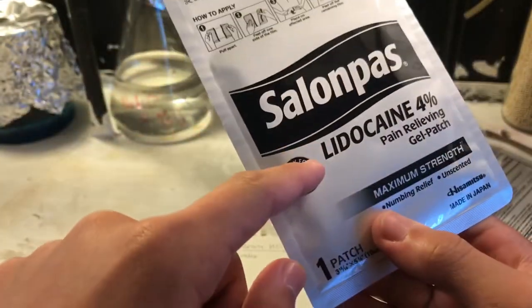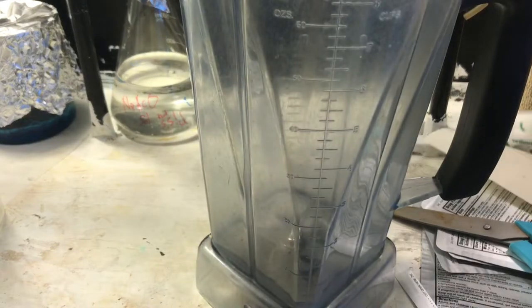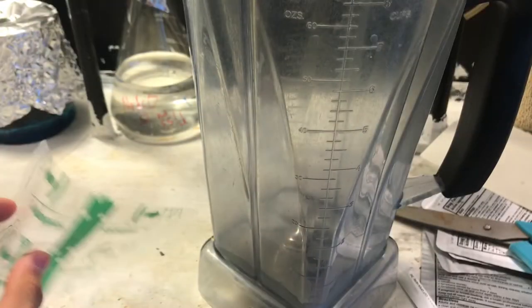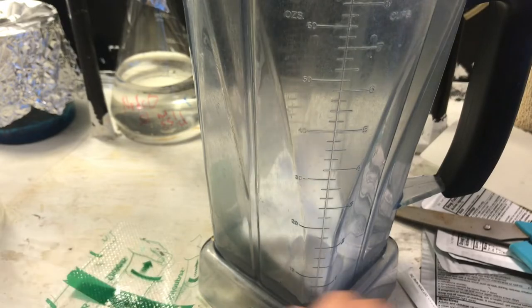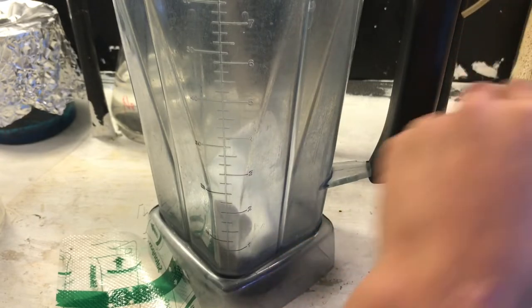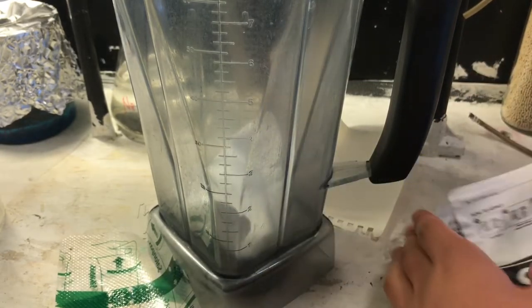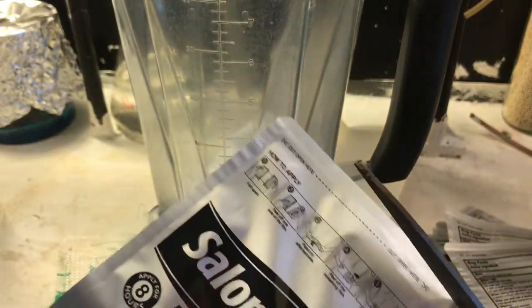We're going to take these lidocaine patches and blend them up with water to extract out the gel. Here's a blender — I have eight patches, four percent, Salonpas brand. I recommend you get this brand specifically because I don't know if other brands will gel the same way.